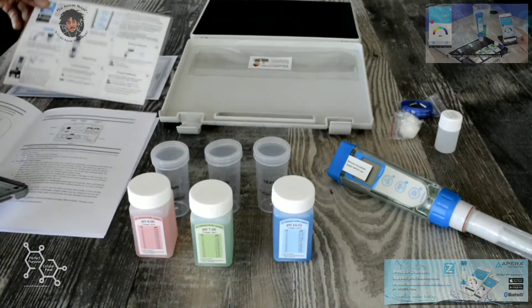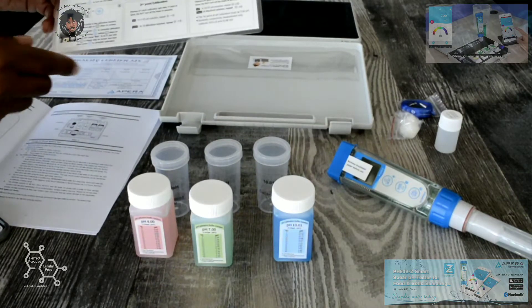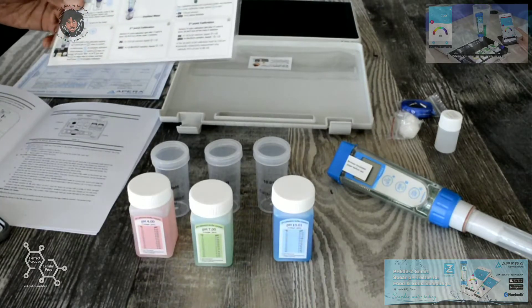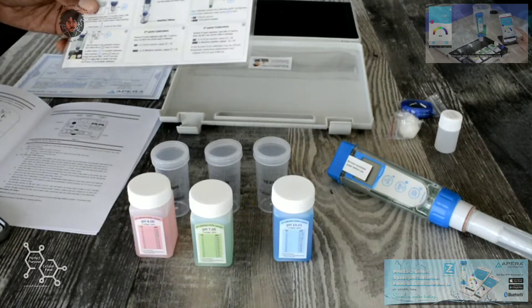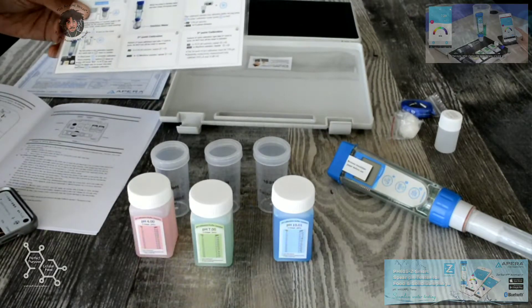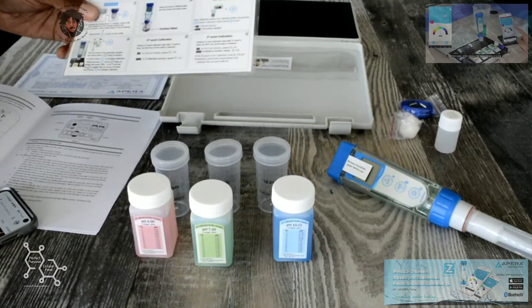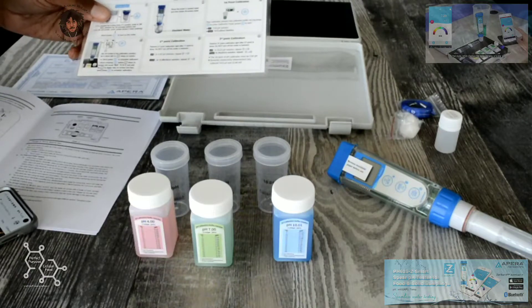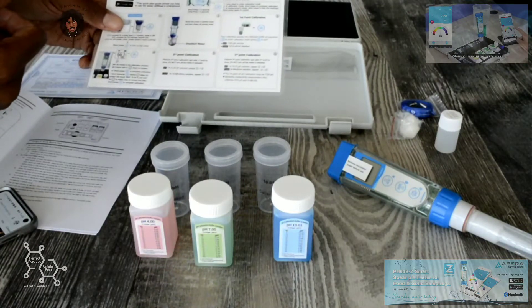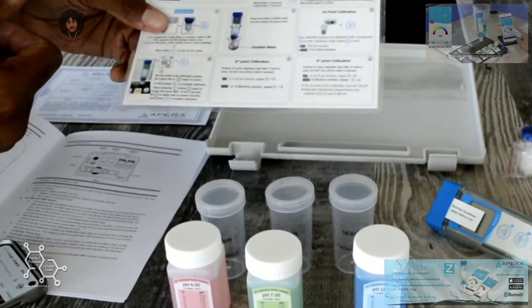The main reason why I purchased the Zen Test edition is mainly because of the capability of downloading a mobile application that will walk you through the process step by step. It'll also pull up neat details about your different test results from the tests that you perform using this meter. You can search Zen Test in the iOS App Store or Google Play Store to download the mobile app.